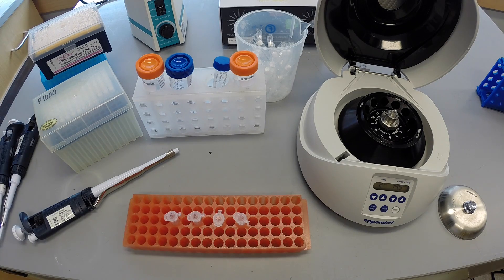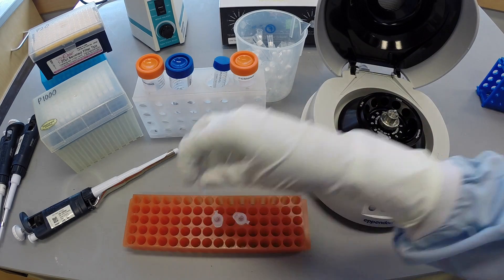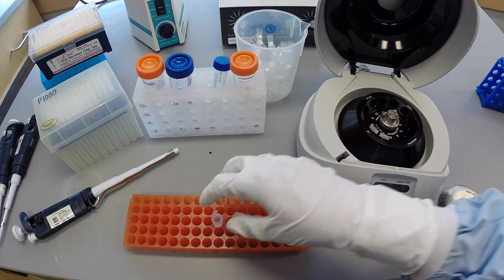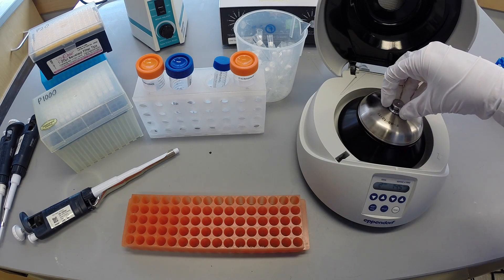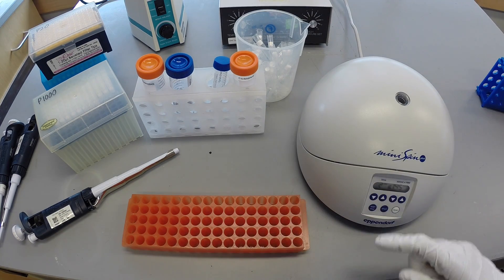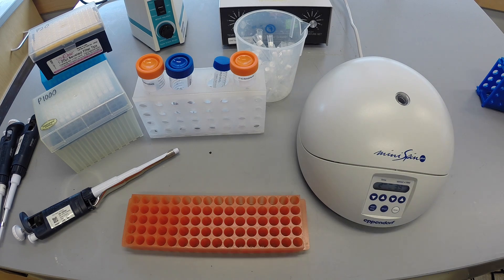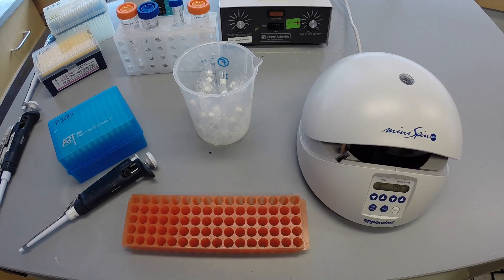Place the samples in the centrifuge, being mindful of balance, and spin for two minutes. Remove the tubes from the centrifuge carefully.